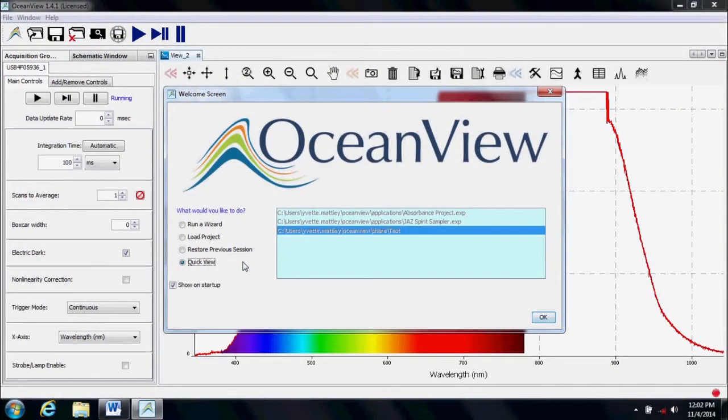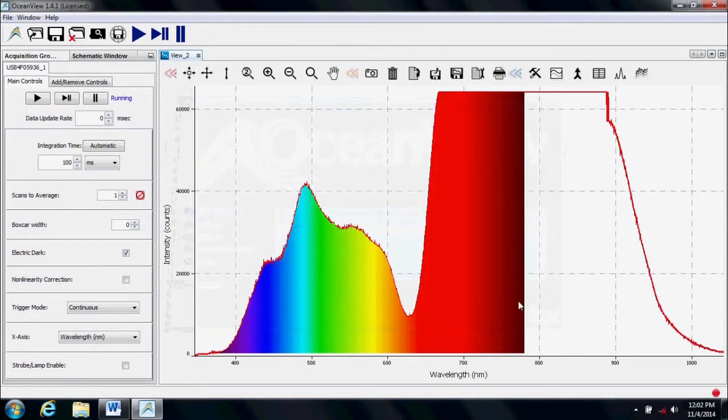Once you have selected the desired option, click OK to enter the software and get started with your measurements.